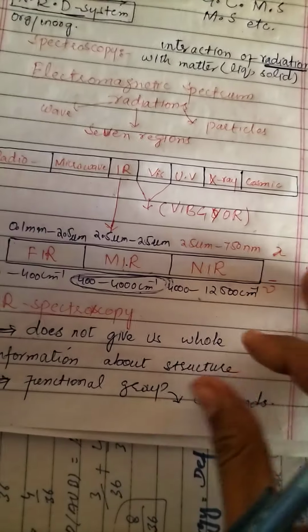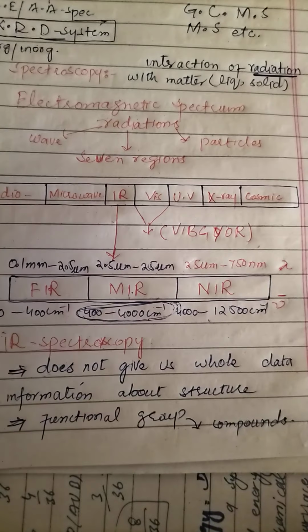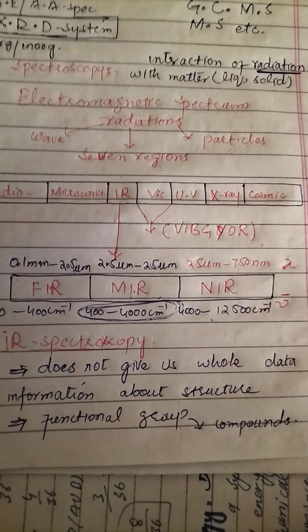Only the functional group can be elucidated through IR spectroscopy.